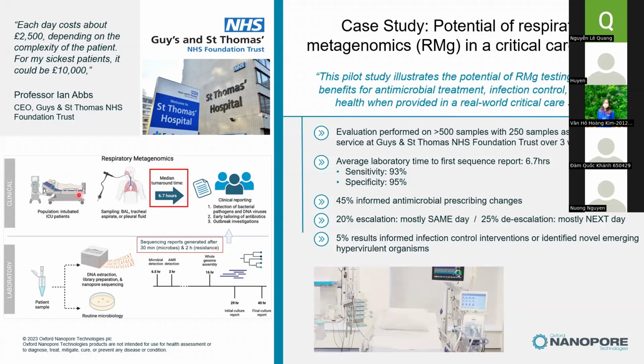Can I please have one question? Please go ahead. I have the MinION, and the MinION is one flow cell. What is the maximum number of samples we can run on the MinION for one flow cell? Does it depend on the kit I use, like the kit with 24 barcodes or the kit with 96 barcodes? What's the maximum number of samples I can run at one time?